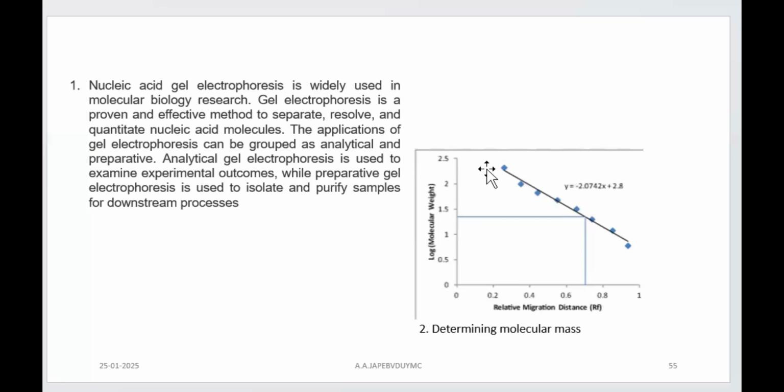So when you talk about mobility, just imagine this is the first protein, second protein, third protein, fourth protein, fifth, like that you have 7 or 8 proteins here. And just imagine a protein whose molecular weight is about 6 into 10 raised to 4, right?